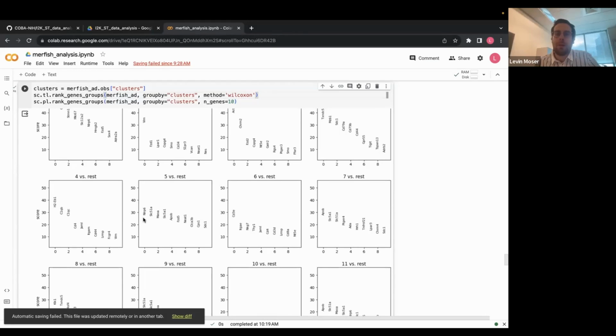So it always depends on your experiment or on your tissue, and depending on that, you might want to choose different clustering algorithms, different parameters, and for example, different methods on how to rank these genes. And what makes biology or bioinformatics hard in general is that there's no definitive answer on what cluster to use and what parameter to use.